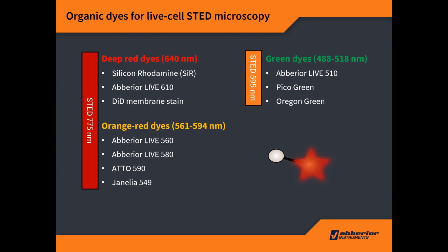So how do we bring these organic fluorophores to your protein of interest? For that we have several options. We either directly link them to certain binding motifs, such as small molecules that bind to actin or tubulin to visualize, for example, cytoskeletal elements, or we use genetically encoded protein tags like SNAP-tag or Halo-tag that are fused to your protein of interest, and then add organic dye molecules that are coupled to the binding partner for the specific tag.